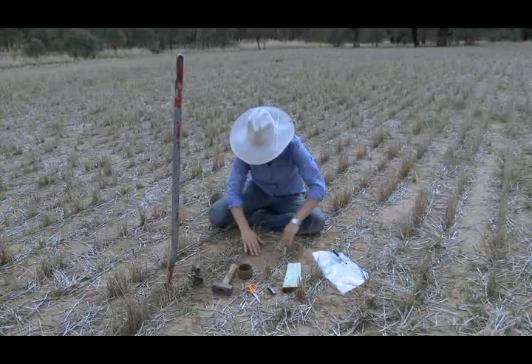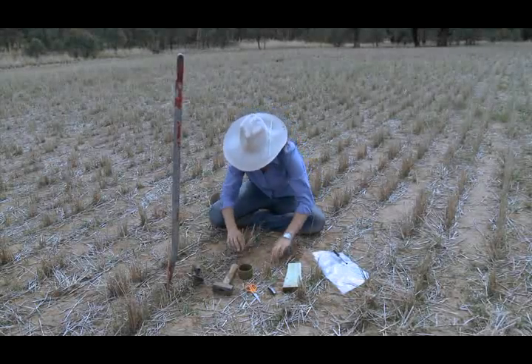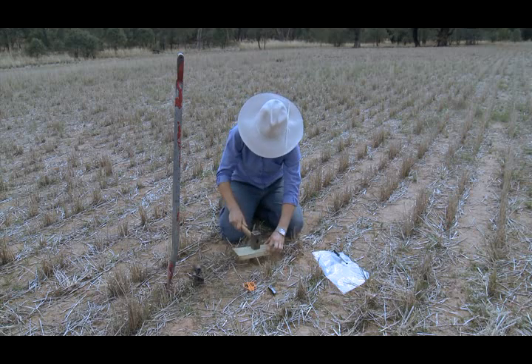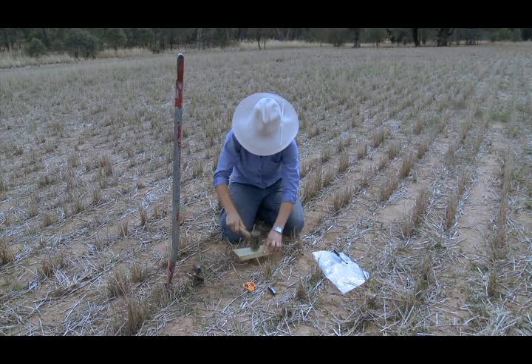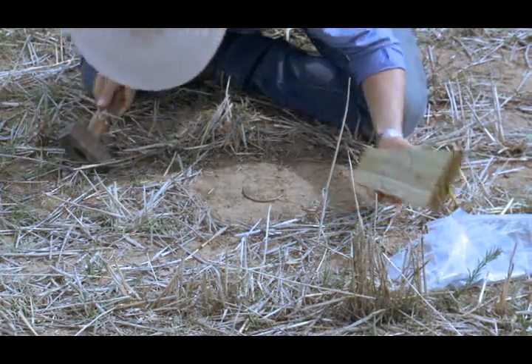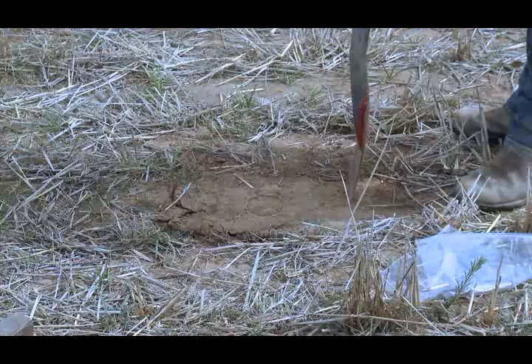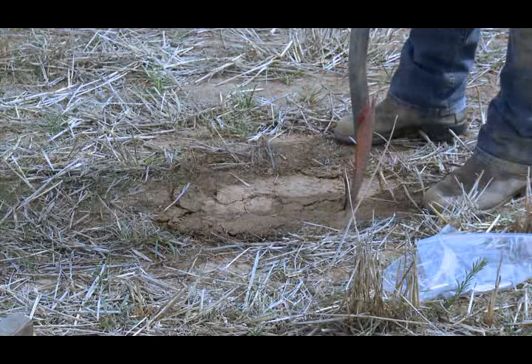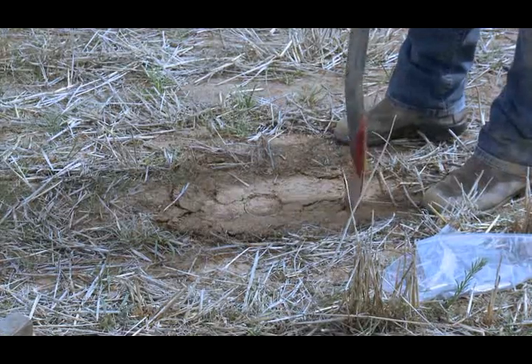Step 1. With scissors, clear the surface of a 15cm x 15cm level horizontal area. Step 2. Use the wood to gently hammer in the ring until it's level with the soil surface. Step 3. Use the spade to clear the soil around the ring until it's level with the surrounding soil.